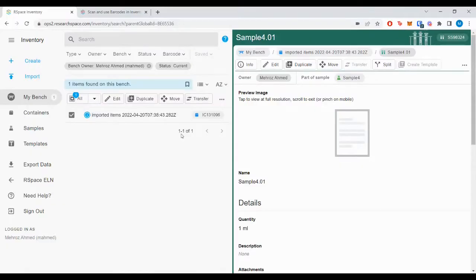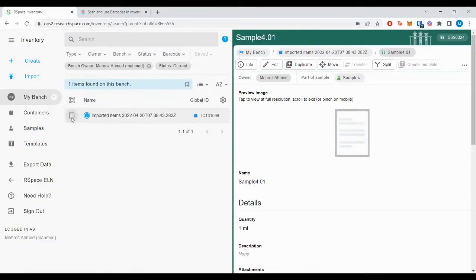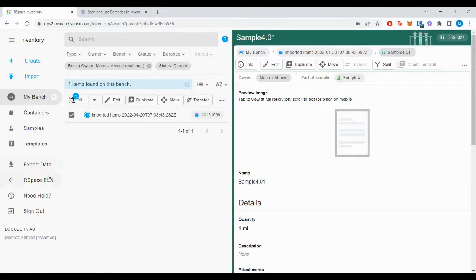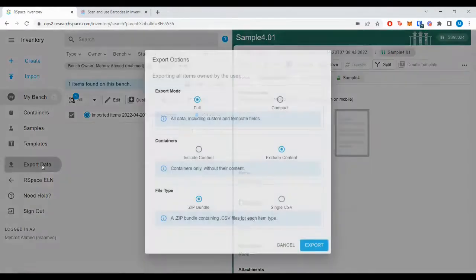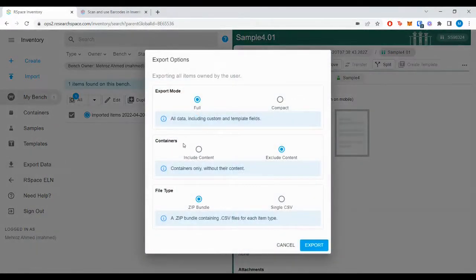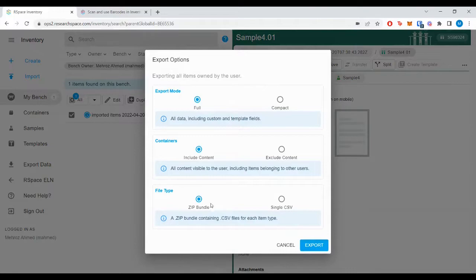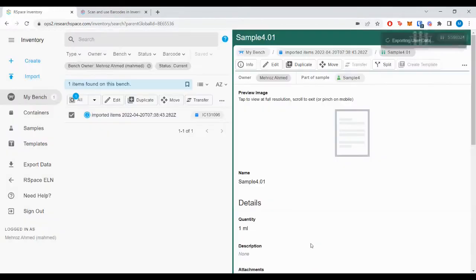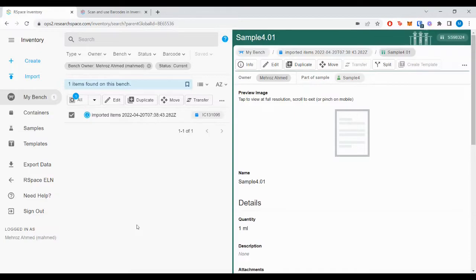To get started, select your chosen data and hit Export. Choose the relevant options and scroll down to File Type where you'll select Zip Bundle. Hit Export and your data will shortly export.